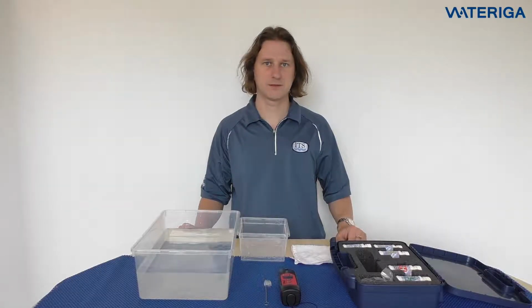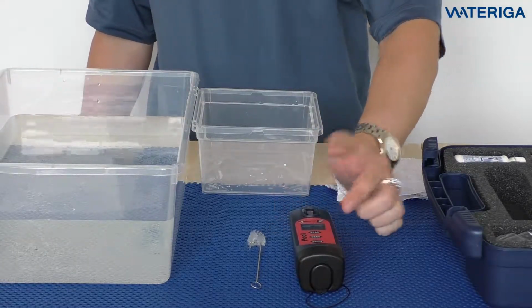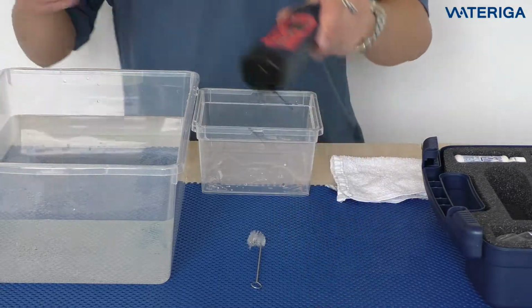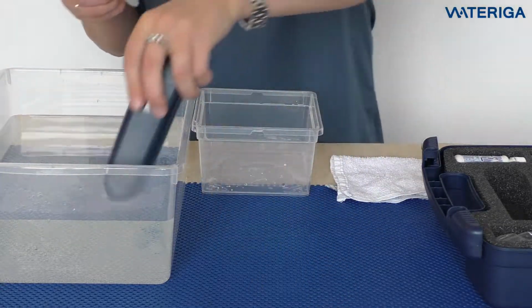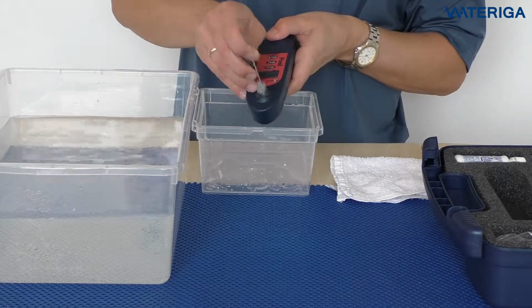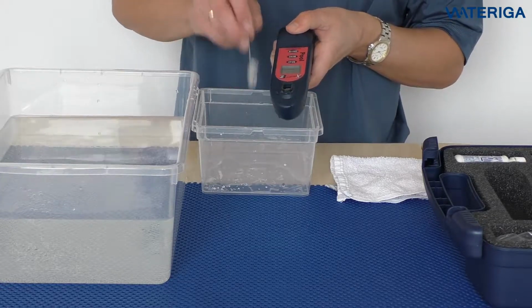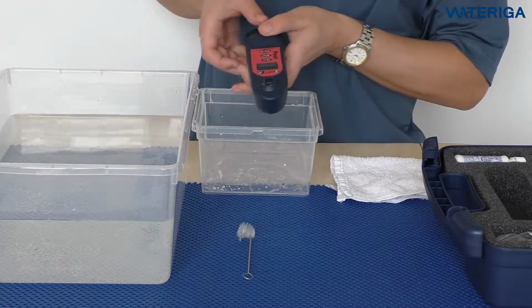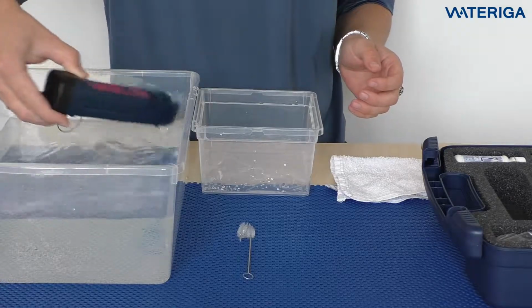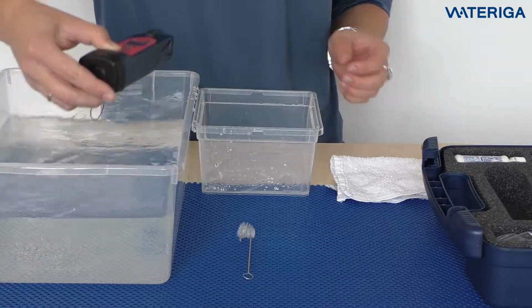Now we're going to do some tests. We'll take the Pool eXact Easy meter and we turn it on by pressing the on button. Then we get some water in the cell and take the brush and clean the cell with the brush. It is important that the cell is clean for more accurate results. Then we rinse the cell 3 times. And finally we fill it up to the top.